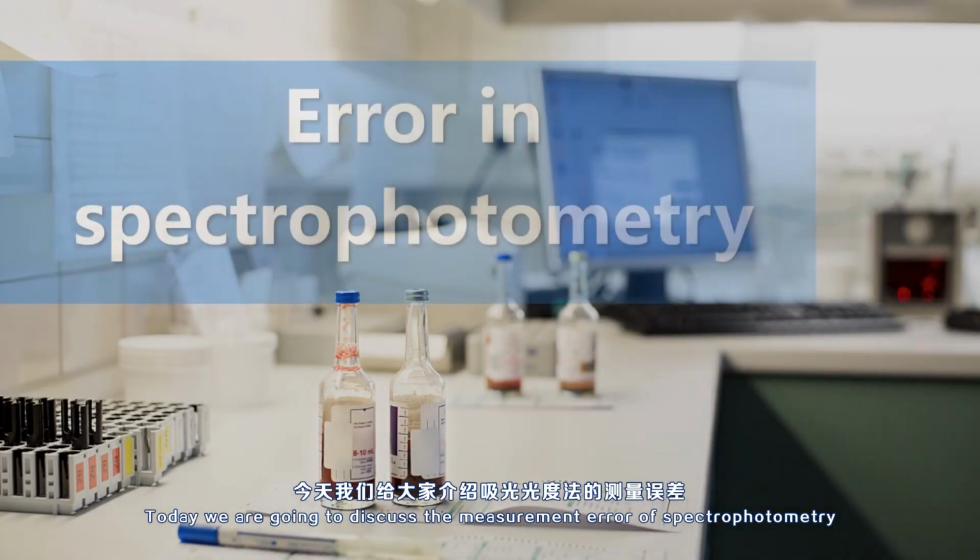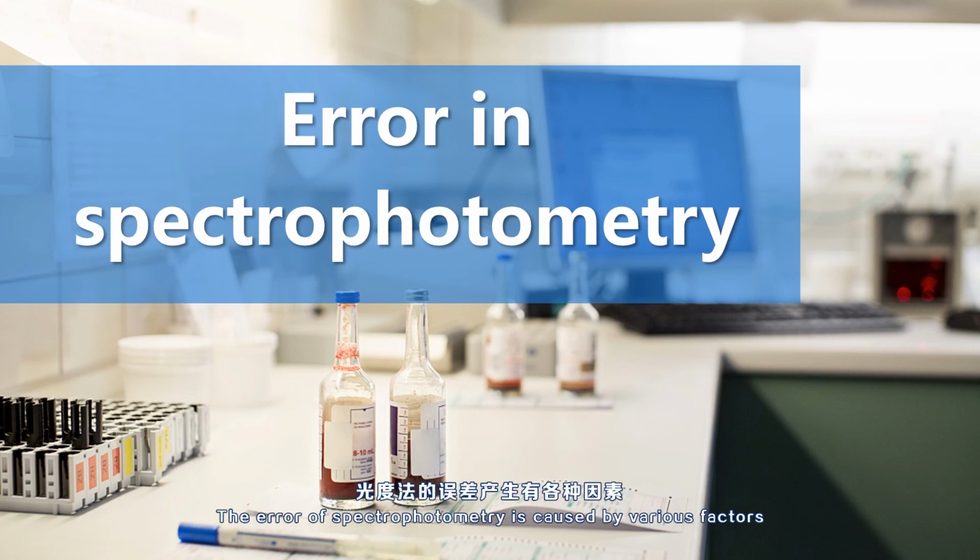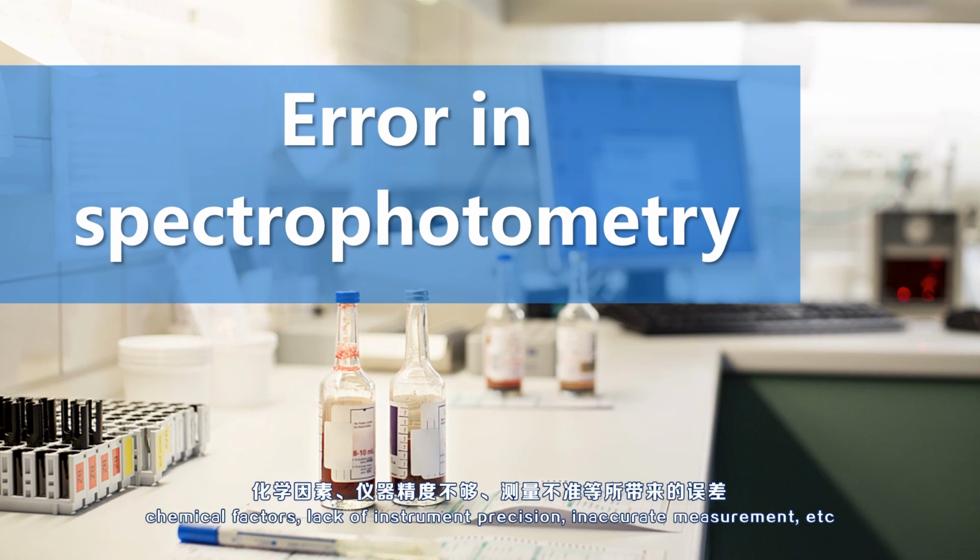Everybody. Today we are going to discuss the measurement error of spectrophotometry. The error of spectrophotometry is caused by various factors: chemical factors, lack of instrument precision, inaccurate measurement, etc.